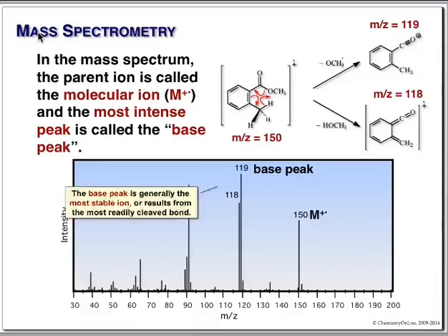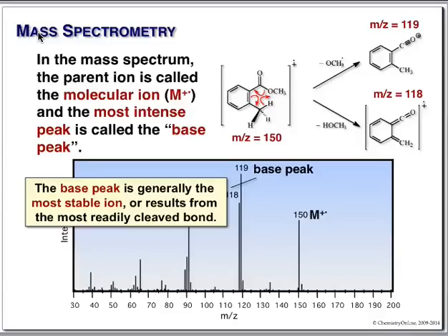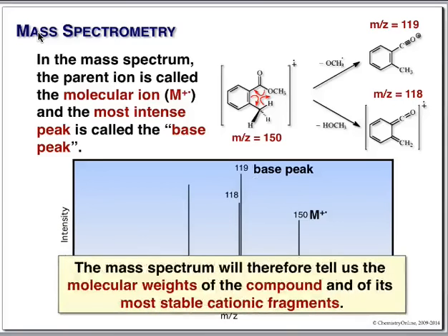All right, just like IR, we're going to take this and we're going to use it to get the simple information out. This just simply says what I said. The mass spec gives us the molecular weights of the most stable cationic fragments. Well, that's what we're looking at.